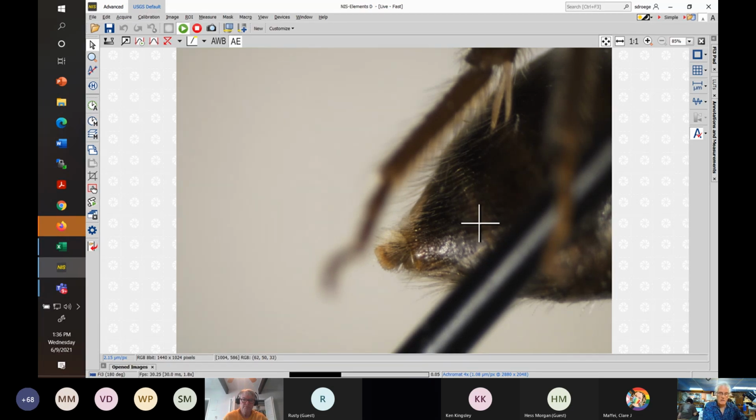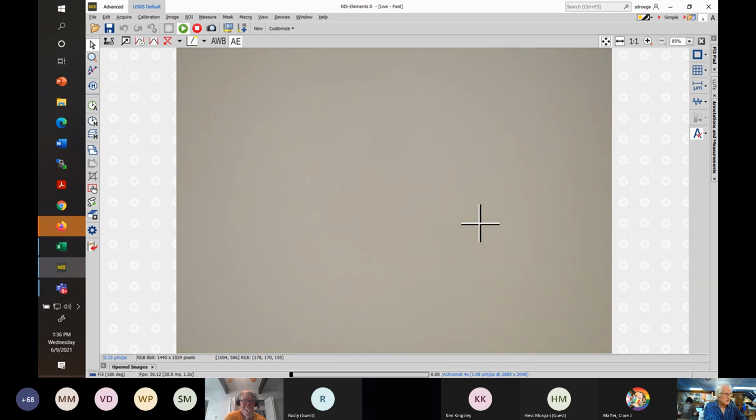All right, now let me go to a different species. Nasonii, that was a Nasonii male, is a good example of about as generic an Andrena as you can get, in terms of, you almost identify it by the lack of any outstanding character when you go through the key. So it's often tedious to go through the key to realize at the end that you're looking at yet another male Nasonii. But maybe if we have time, I'll go back and show you a little Nasonii trick.